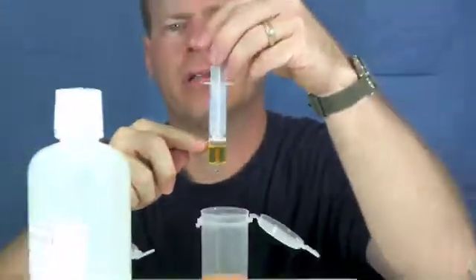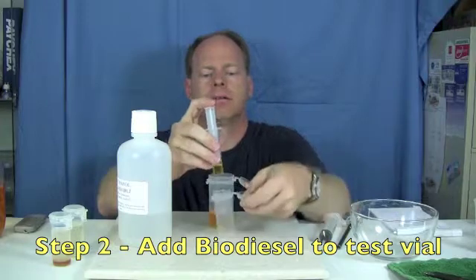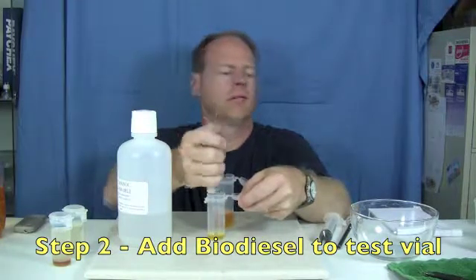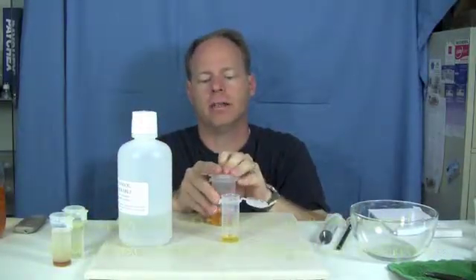Open up your biodiesel to be tested and you're going to suck out 3 milliliters of the biodiesel. We've measured out 3 milliliters of biodiesel and we're going to put this into our little vial, and then we're going to measure out 27 milliliters of methanol.